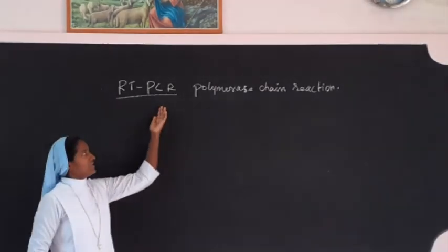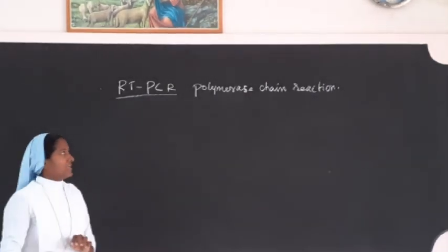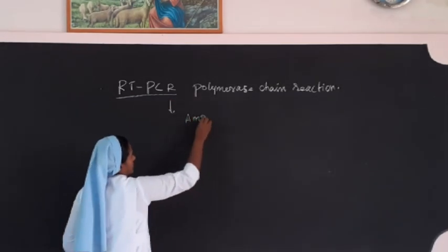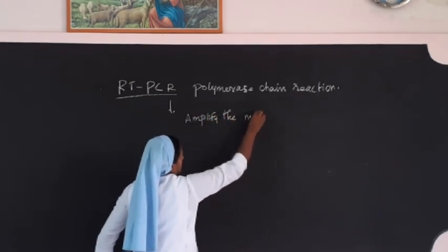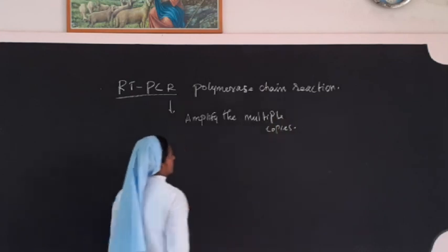It is a technique used to amplify multiple copies of DNA. So what is the use of this PCR technique? To amplify the multiple copies of DNA.